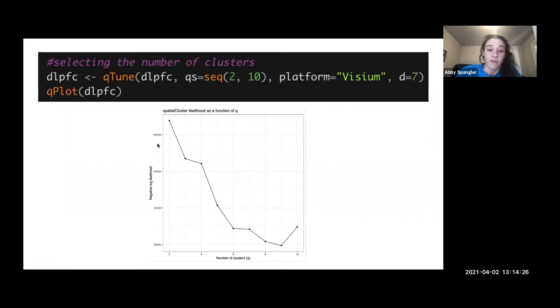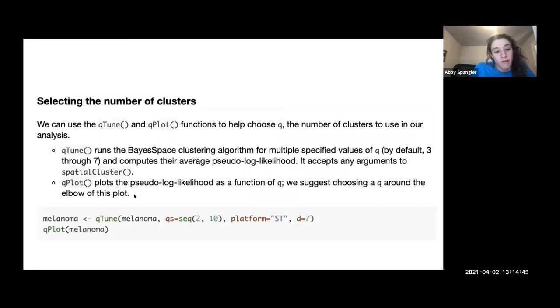And yeah, so this is the negative or the log likelihood, which is basically a measure of significance of how sure you are that these clusters are distinct clusters. So that is as far as I understand about this measure here. This is again from their vignette, basically showing you the same thing except it was a different platform and a different data set.